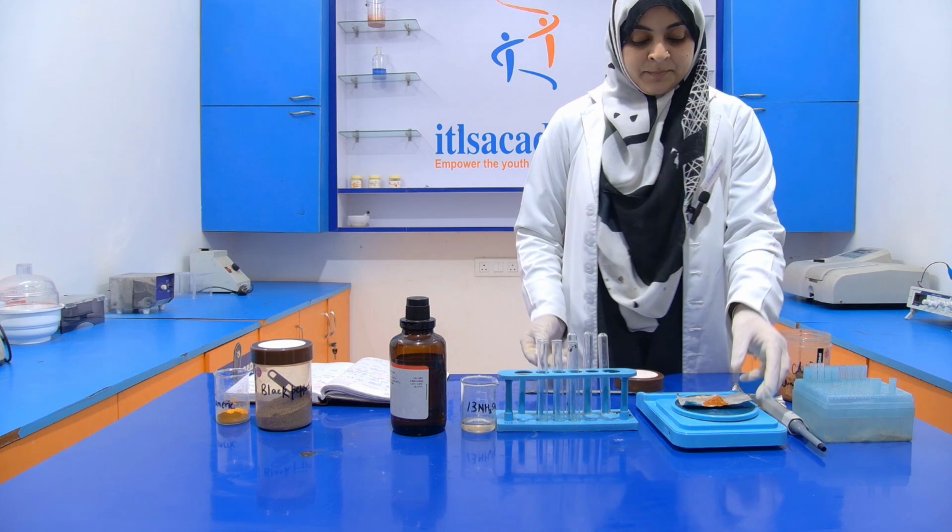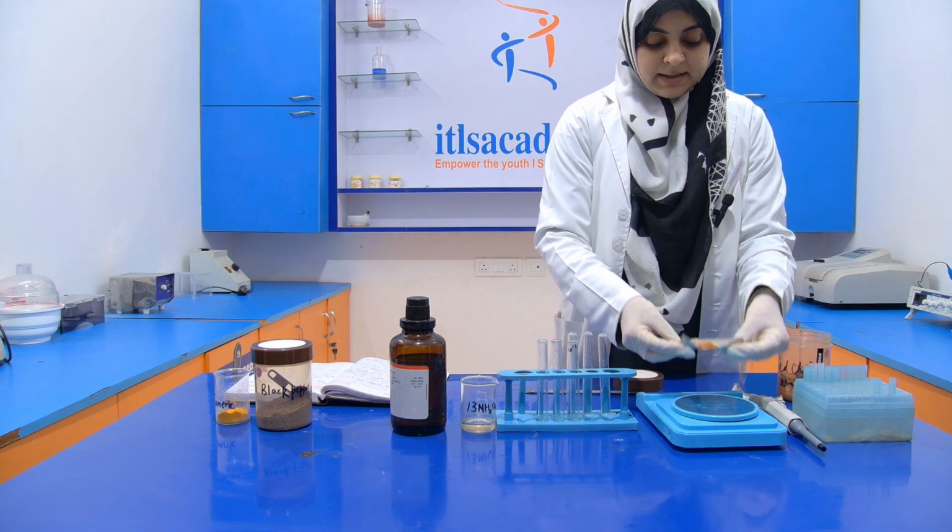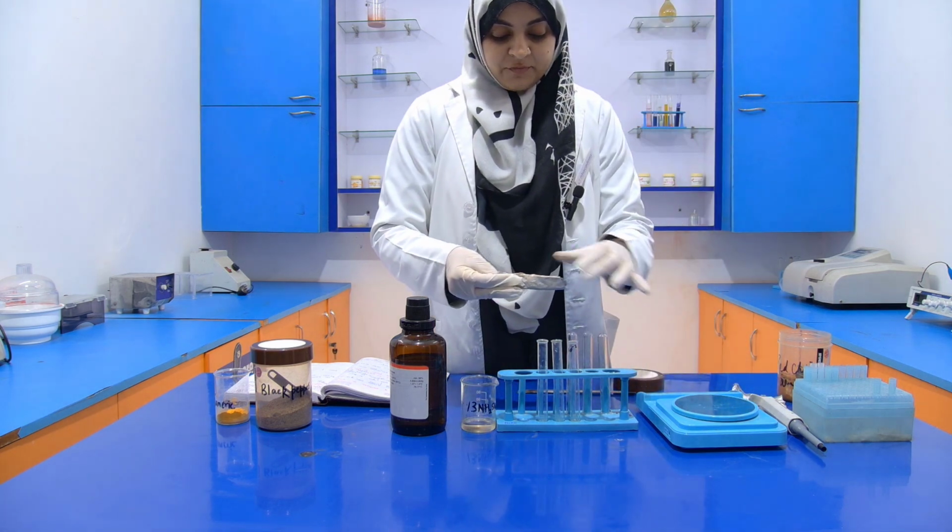Now it is 1 gram. Transfer this 1 gram sample into a test tube very carefully.